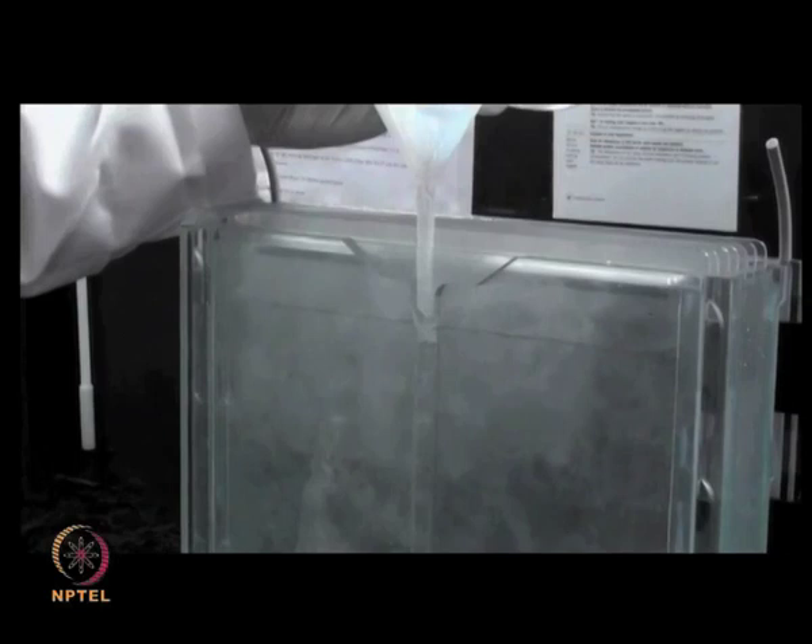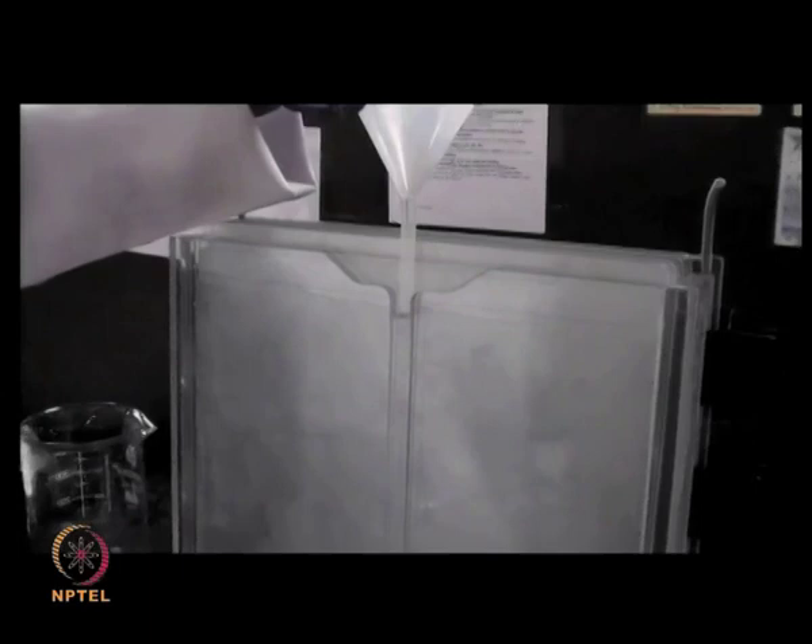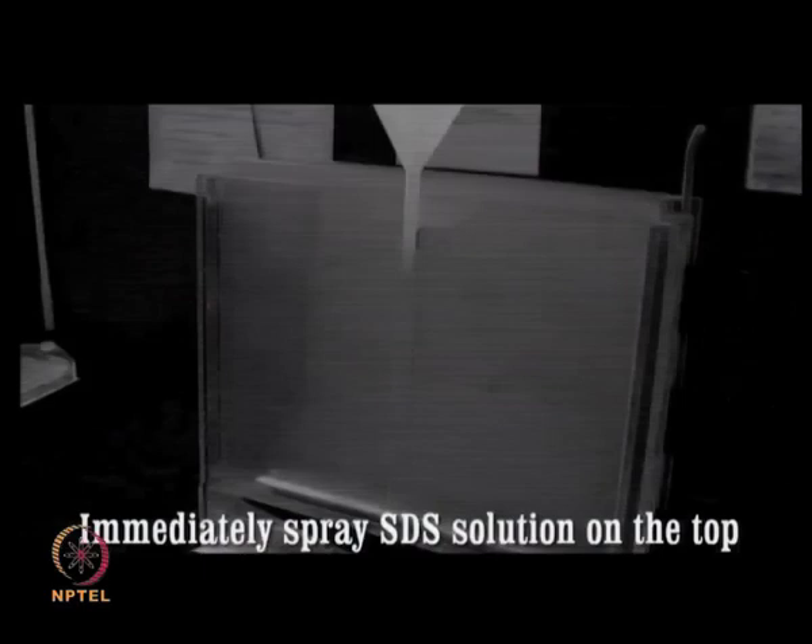Ensure that the solution spreads evenly such that the top edge of the gel is uniform. Allow the solution to stand for polymerization to occur, and spray a solution of SDS across the top to ensure that the gel does not become dry.